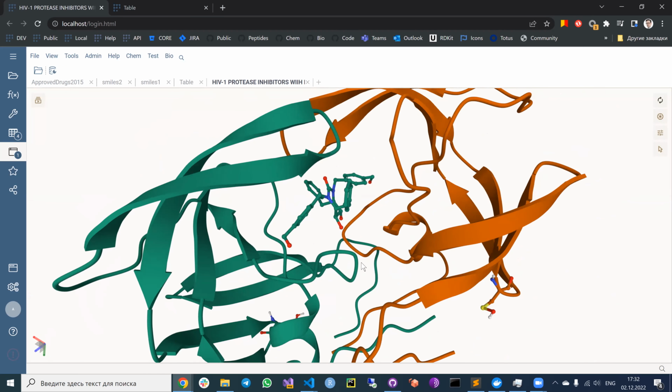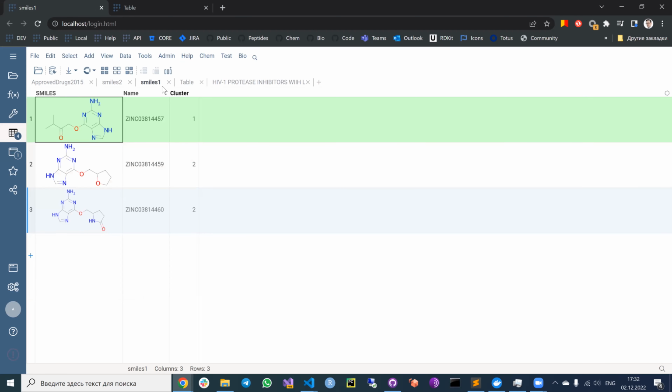We will continue to cover more different notations. And now I would like to show you one of our new features.